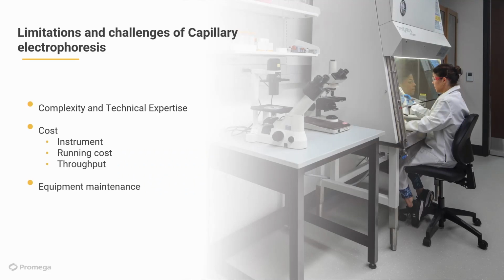However, it is not without some limitations. CE instruments can be complex and they do require a lot of technical expertise to run and maintain. The whole CE workflow can be costly. Some of the larger instruments, their price ranges from £150,000 all the way up to more than £400,000 for the really large 96 capillary instruments.